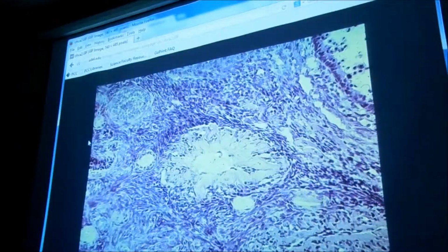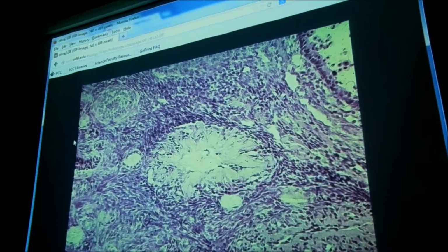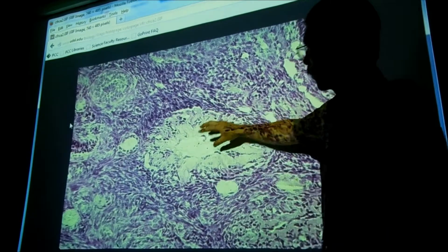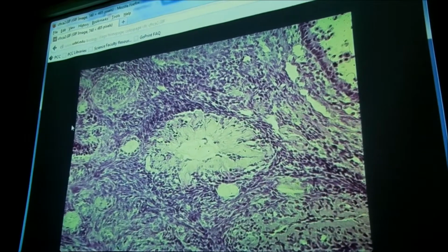Right. So I've got a little version here. Here's another albicans. Looks like a puffy cloud, but notice how small it is compared to the follicles now. So these are follicles. So that's just shriveling up and becoming a scar. So the luteum is usually big, the albicans are usually small.